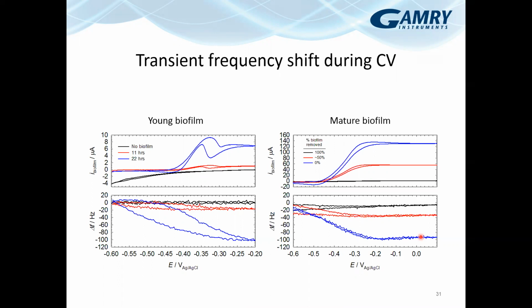Okay. Yeah. Jerome, sorry to interrupt. There was one small update to this question just now, and it's being specified that it's only a small amount of ionic liquid in water, so that the viscosity isn't high, it's actually quite low.